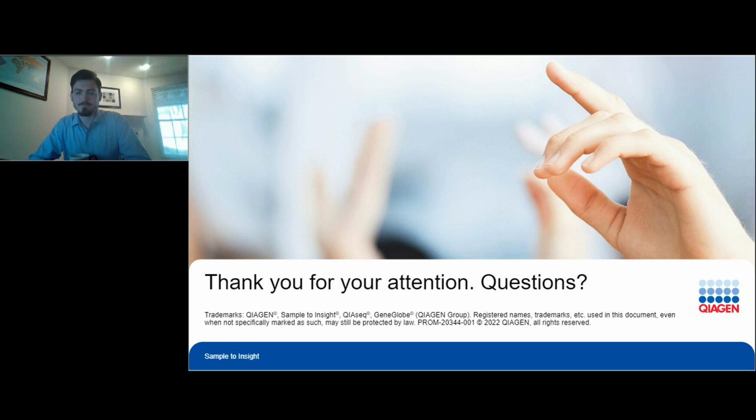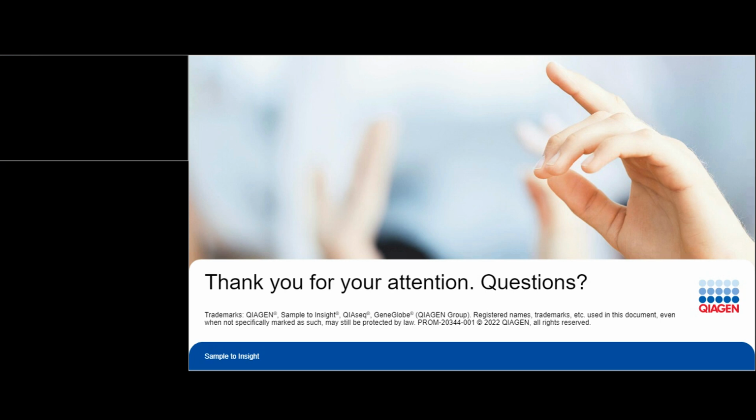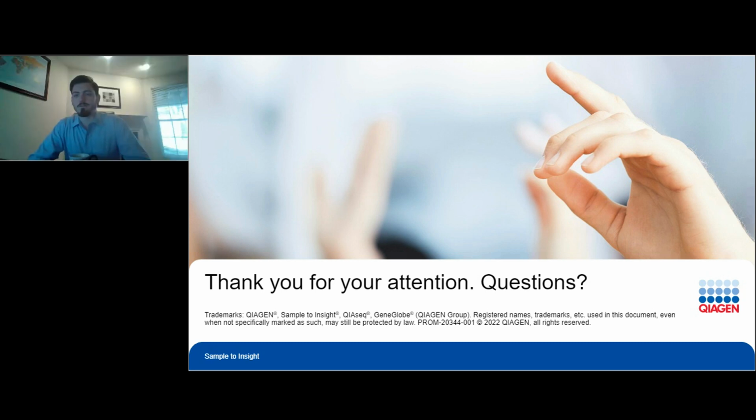Okay, perfect, thank you. Another question here. Actually, there's a couple questions here. Maybe I can just generalize these. Some people are targeting specific genomes of bacterial pathogens, and they're wondering if it's possible to design specific hybrid capture for their genes. I think that they're asking about, is there a custom solution that's available? Yeah, so at the moment, there's no custom solution available, but that is something that we hope to have at some point in the future.